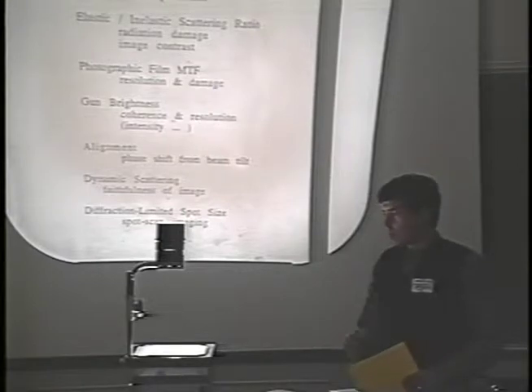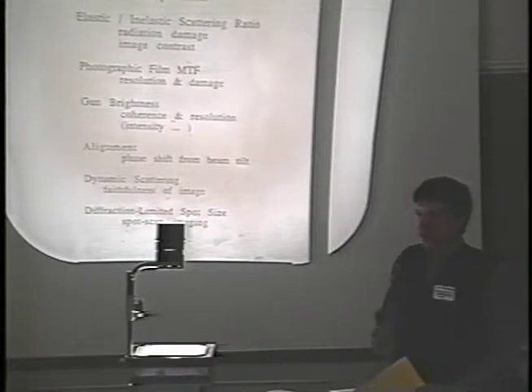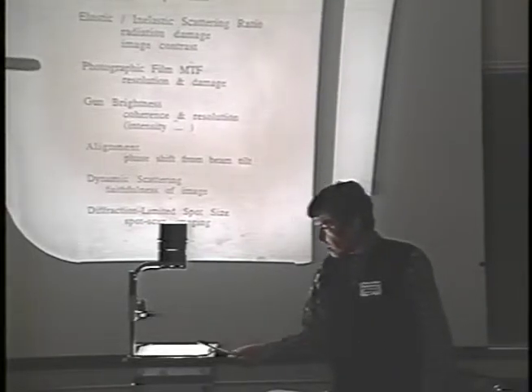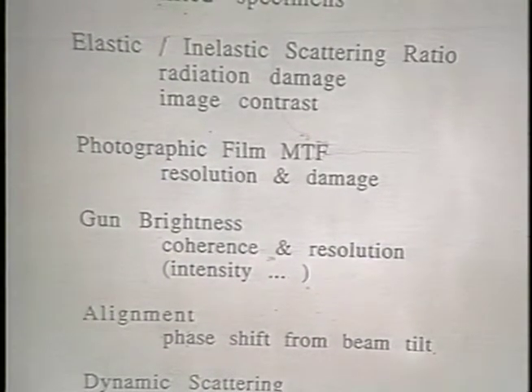So I suspect you're all familiar with the effect, or those who've worked with a high voltage microscope know, that the image contrast is lower. And that's a significant disadvantage, but it's one that we can live with and actually compensate for. The upside of all of this is that the ratio of elastic to inelastic scattering improves a small amount as you go to higher voltage. So the inelastic scattering drops off by, I guess, about a factor of 2. The elastic scattering that leads to the image contrast that you want doesn't fall off quite so much.